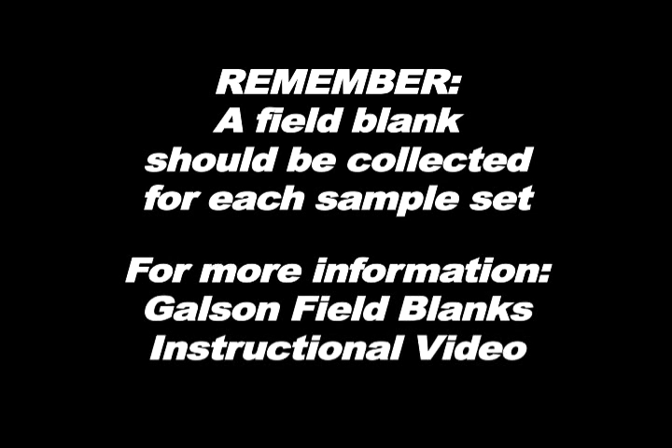Remember, a field blank should be collected for each sample set and should accompany the monitor during all periods except actual sampling. For more detailed information, watch the Galson Field Blanks instructional video.